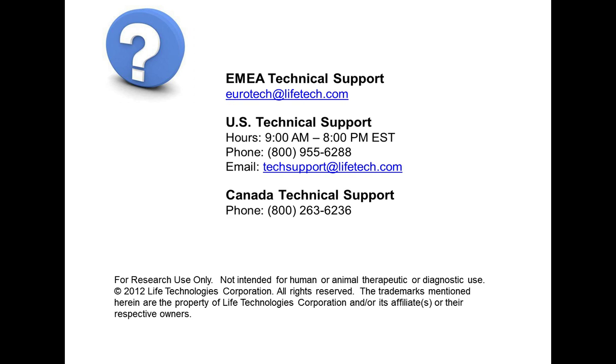So there is a question about understanding which cells are dead, and this is a really good question. For the most part, scatter detection is not a reliable method for distinguishing dead cells from live cells, and it is best determined with a fluorescent dye.